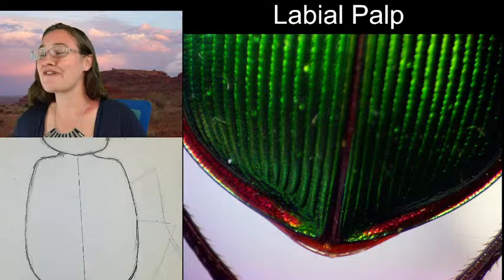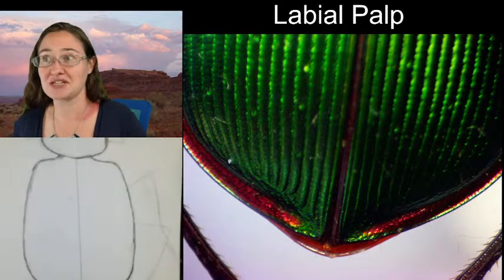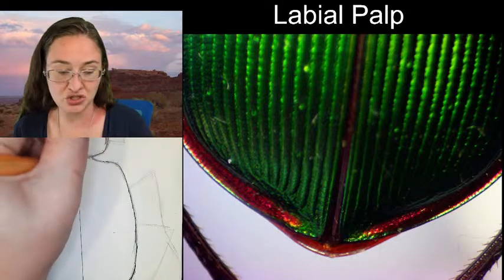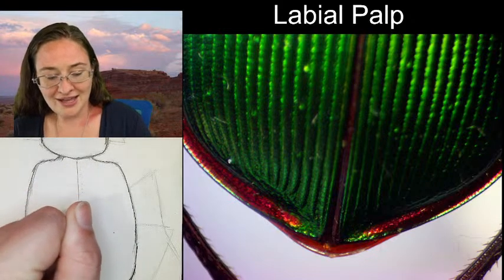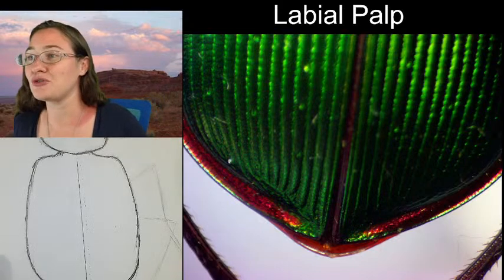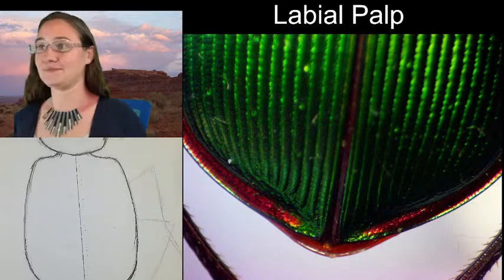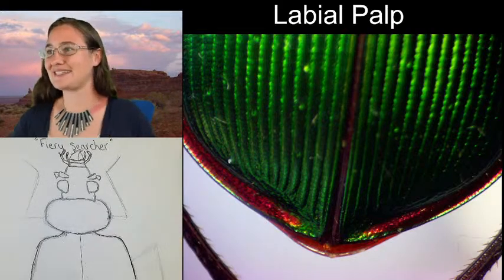Alright, and then if you did want to go through, keep in mind that the lines on our back are not striations. They're not just straight lines. They're individual punctations. They're little dots. So if you were going to go along and do these striations, you would want to do individual dots in lines all the way down the elytra. Now, I don't believe that you, ladies and gentlemen, want to watch me do that. So we're going to move past that, but you can go ahead and do that with your time if you'd like. All right. Let's do legs.